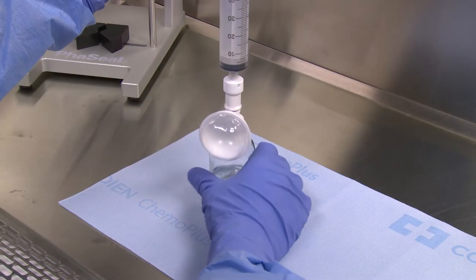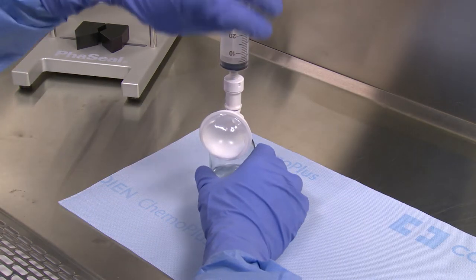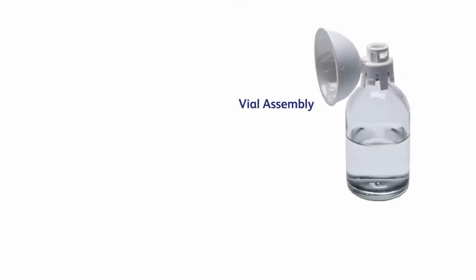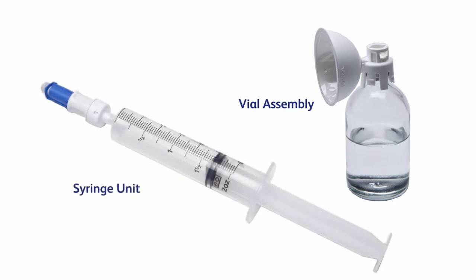Let's examine the procedure for preparing a syringe from a single drug vial. Before beginning, prepare a BD-facile vial assembly. For reference, please see the module on building the vial assembly. You'll also need to prepare a BD-facile syringe unit. For reference, please see the module on building the syringe unit.